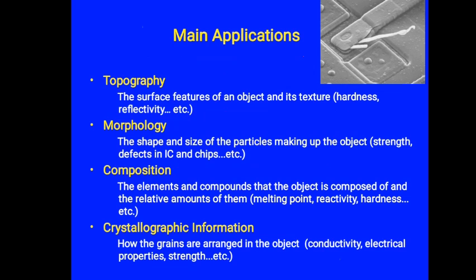Next, the main applications are topography, the surface features of an object and its texture, that is hardness, reflectivity, etc. Morphology, that is the shape and size of particles making up the object. Next, composition and crystallographical information.